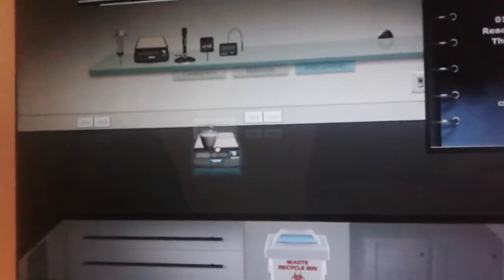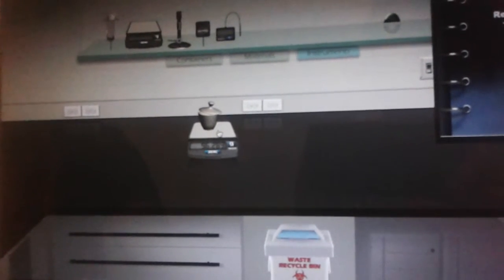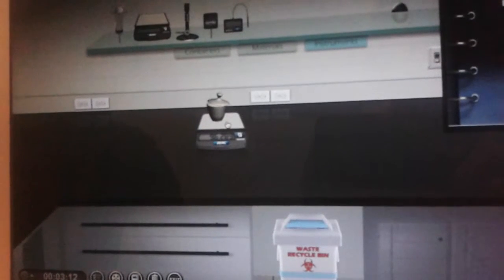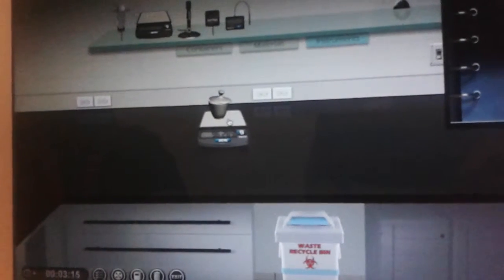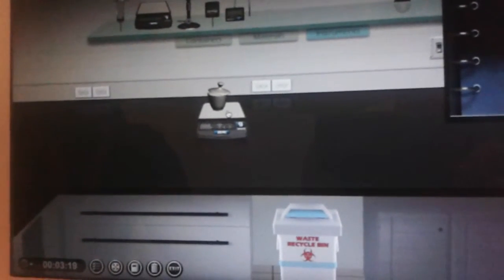So the crucible isn't cooling down for a minute. We now place it on the balance and weigh it. We notice that there's been a change in mass of the contents of the crucible. It has risen from 93 grams to 96.289 grams, which suggests that a chemical reaction has taken place. The details of this chemical reaction are given in the next segment.